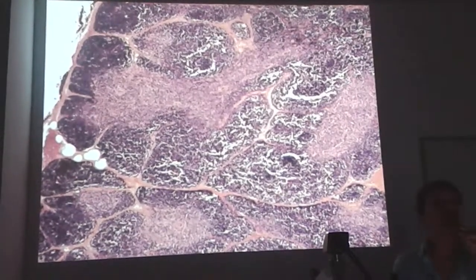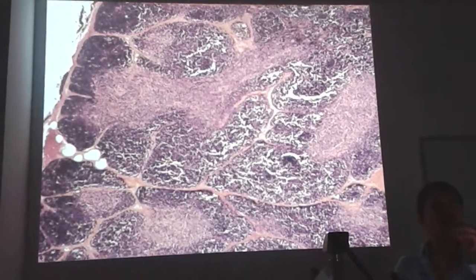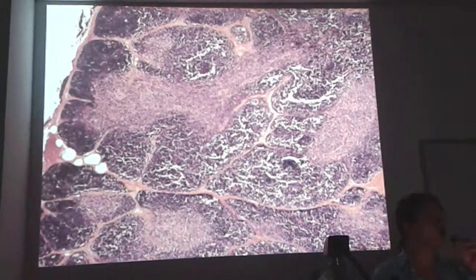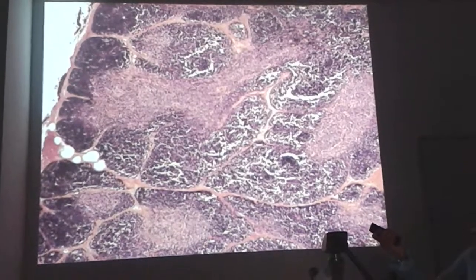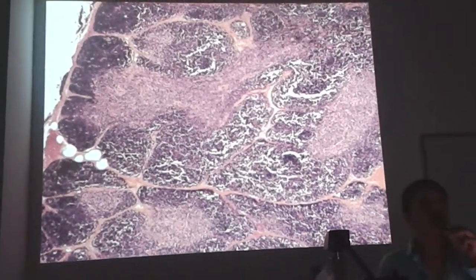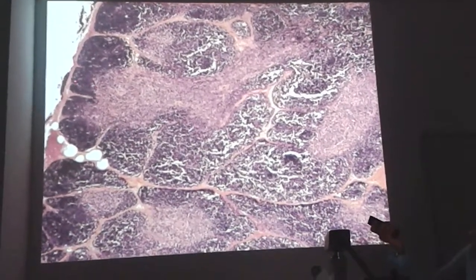And as you know from your theoretical lectures, the cortex of the thymus consists of lots of T lymphocytes. These T lymphocytes are trying to differentiate, they are trying to become mature, all right? So in the cortex of the organ, you will see lots of T cells. But without using antibodies, it's not possible to differentiate which type of lymphocytes these are. All we have to know is that in the cortex of the thymus, there are lymphocytes in differentiating stages.